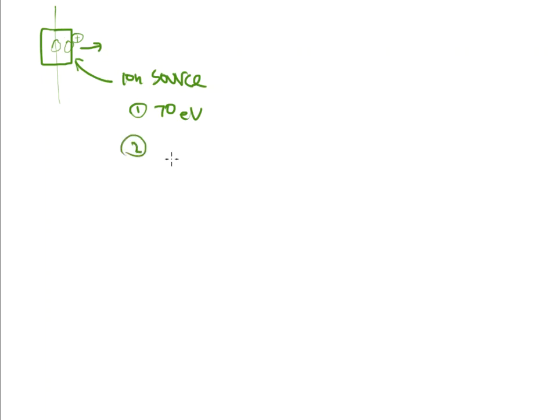Another setting that we really didn't talk about is the temperature of this ion source box. And this temperature typically is going to be 200 degrees Celsius. Many times I have to confirm that temperature. I want to put that temperature into the method and save it so that when I run samples, everything's ready to go for me. So this is a temperature setting that I can change. I can crank it up a little hotter, I can lower it a little, but 200 is generally the recommended temperature that I would see with many different methods.